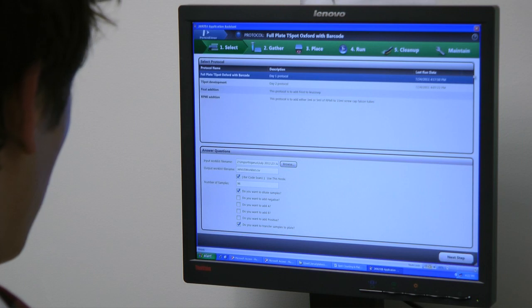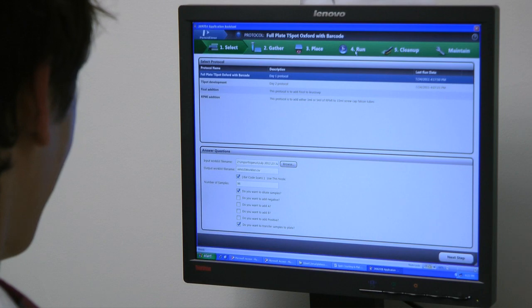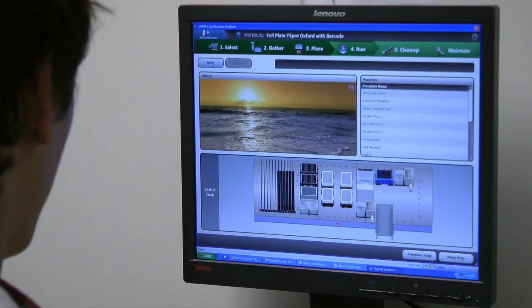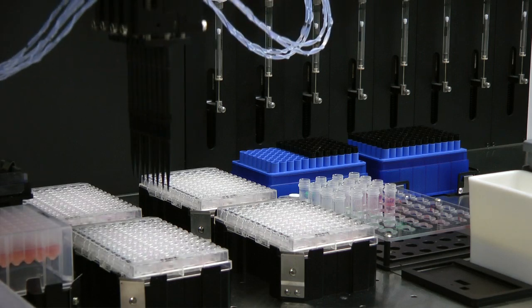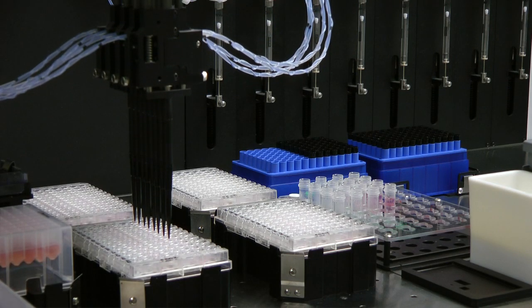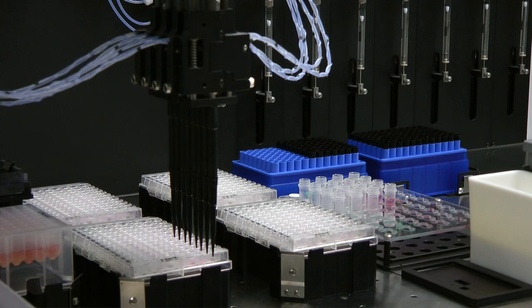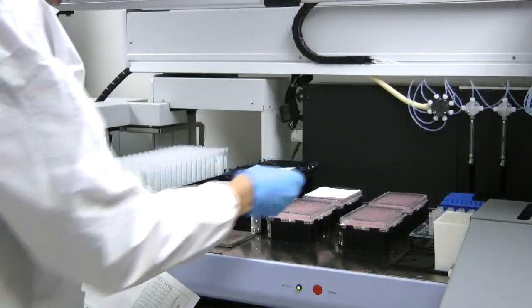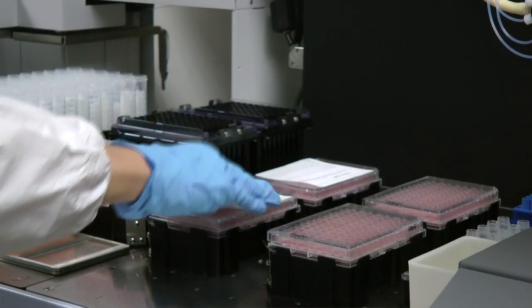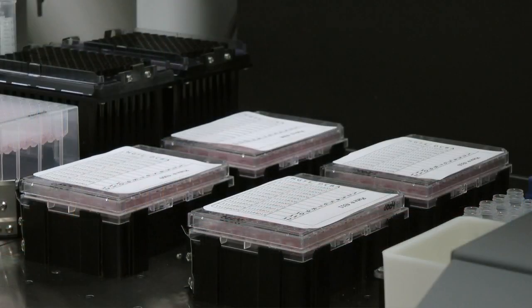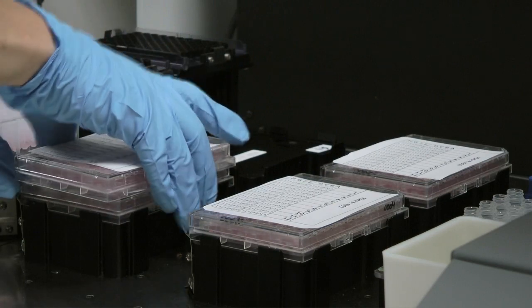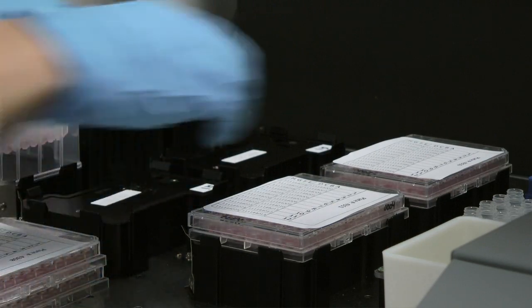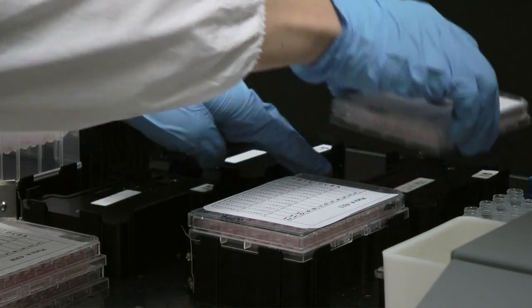The technologist interacts with the instrument software to input the plate numbers, an essential step for later when plate labels and printouts are generated. The T-spot TB protocol is initiated, and in approximately 20 minutes, 96 unique samples are plated along with reagents. Plate lids identify the specific location of each sample as plated by the Janus. Each batch of 96 samples takes 40 minutes from start to finish, enabling many hundreds of samples to be processed per day.